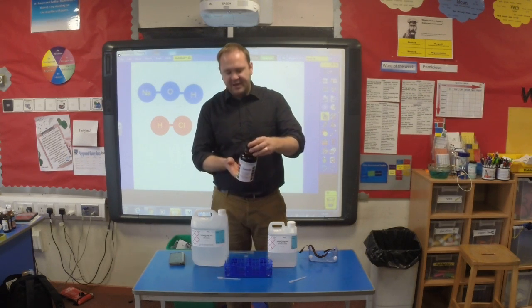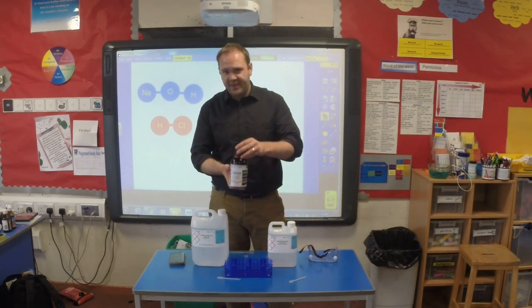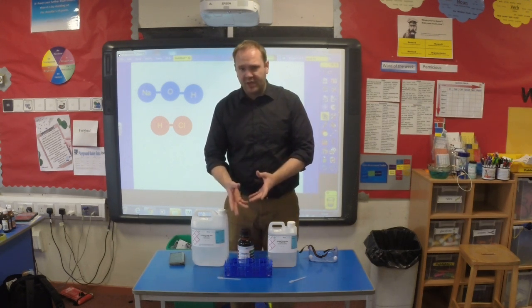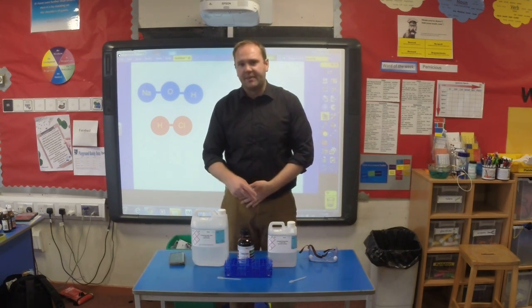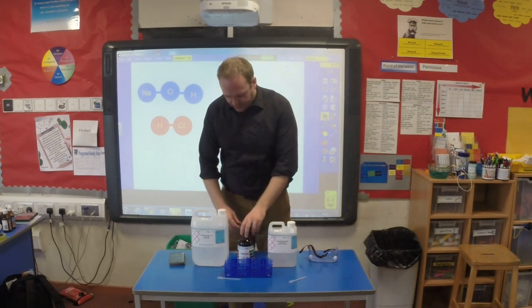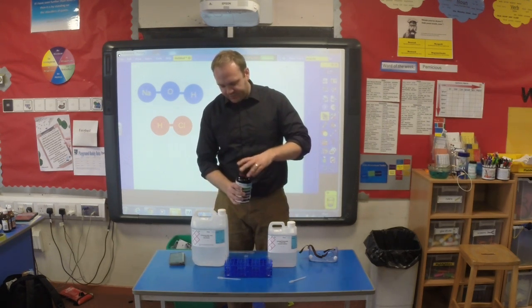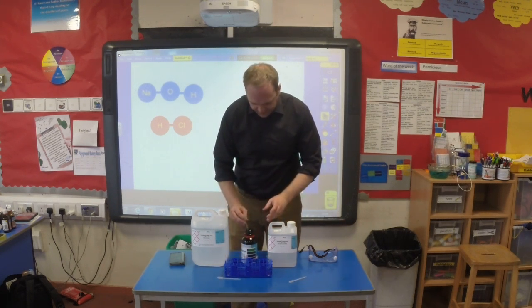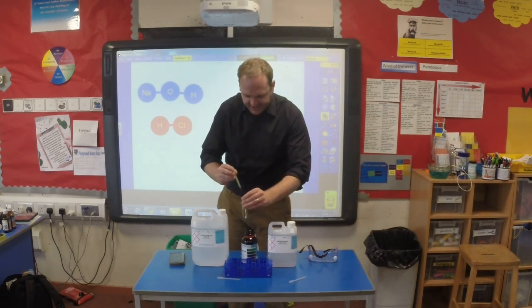The other thing I have is universal indicator solution, and this is going to be used to tell us whether the solution we have in this test tube at any one time is more acidic, more alkali, or neutral. So what we're going to do, we're going to start off just by establishing that this is in fact neutral.